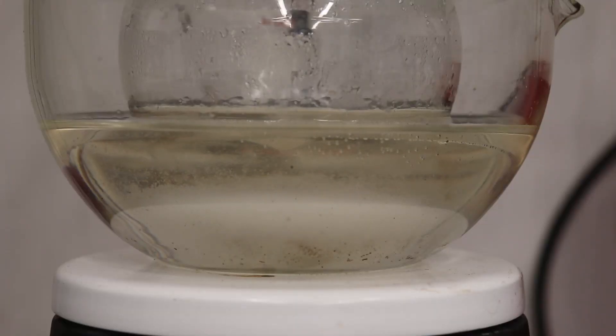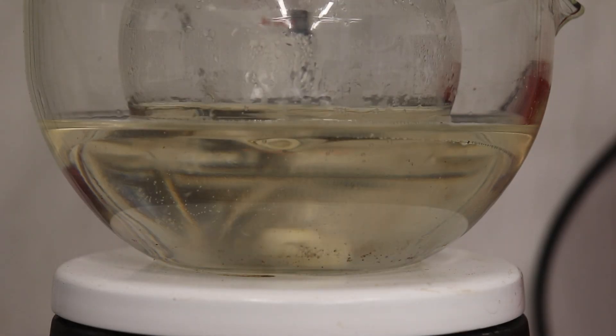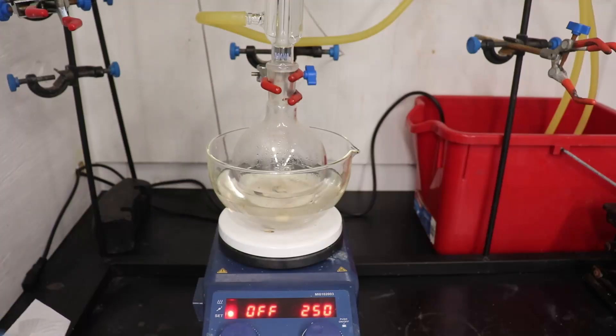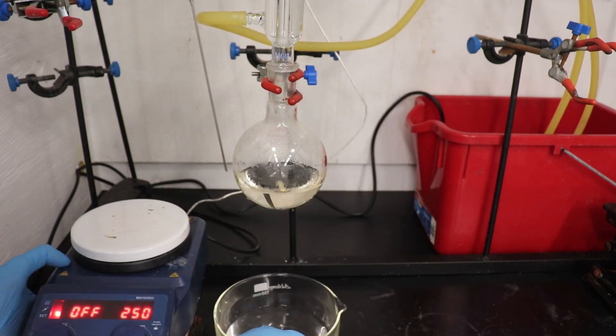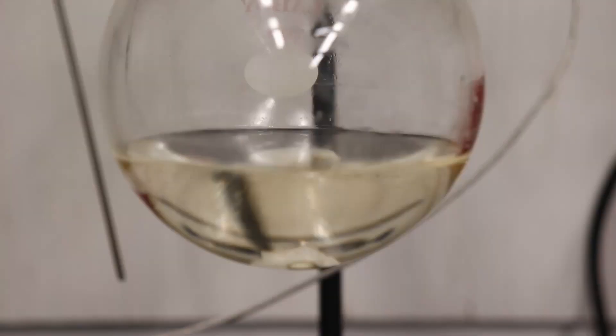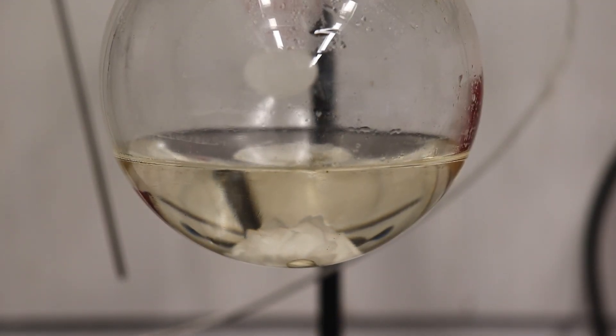The mixture was allowed to heat for an hour, over which time the succinic acid gradually dissolved, leaving a clear solution. The heat was then removed from the flask, and it was allowed to slowly cool to room temperature. The mixture ended up supercooling, and you can see the succinic anhydride crystallizing out in real time.